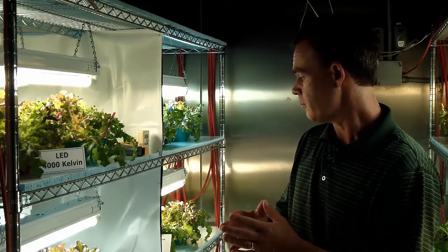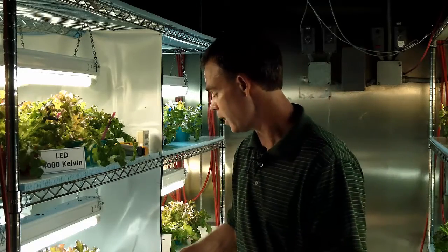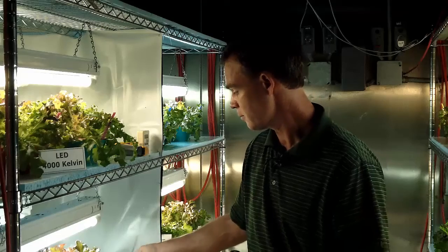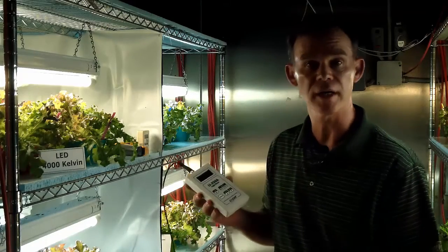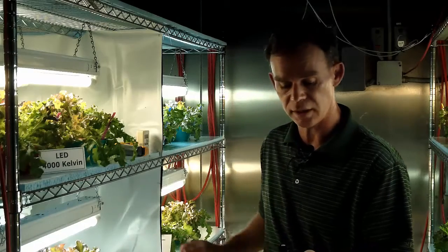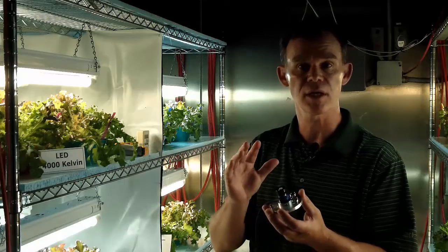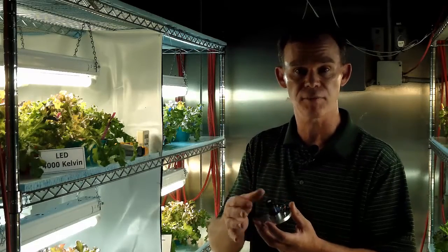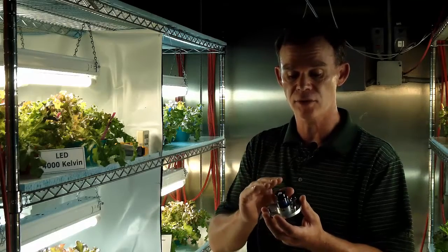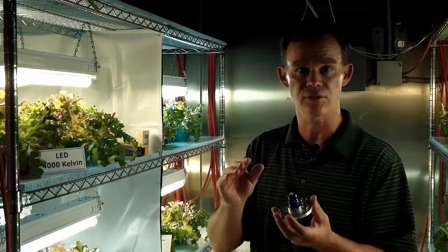Okay, well, we can measure light in a growth chamber, and this is a light meter. This is quite a sophisticated tool. It's a very good quality light meter, and the difference between a really good quality light meter for measuring plant growth versus a cheaper light meter is that it's going to be measuring the light in that photosynthetically active radiation range.